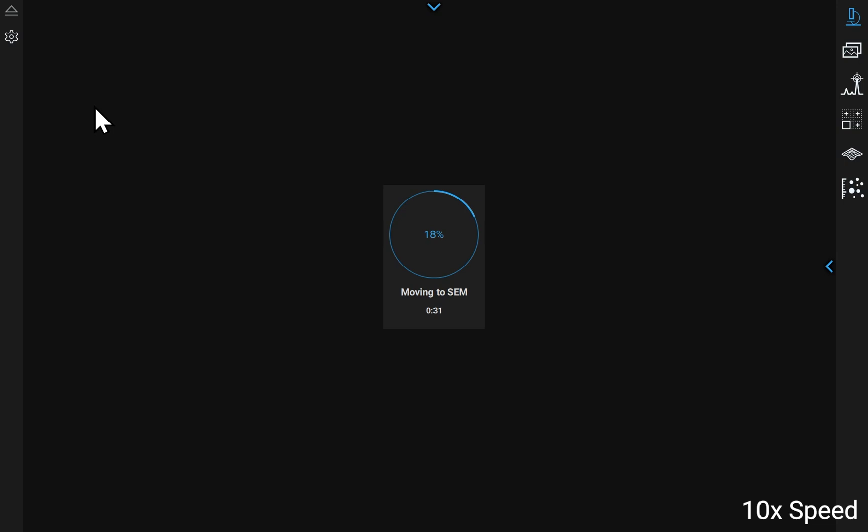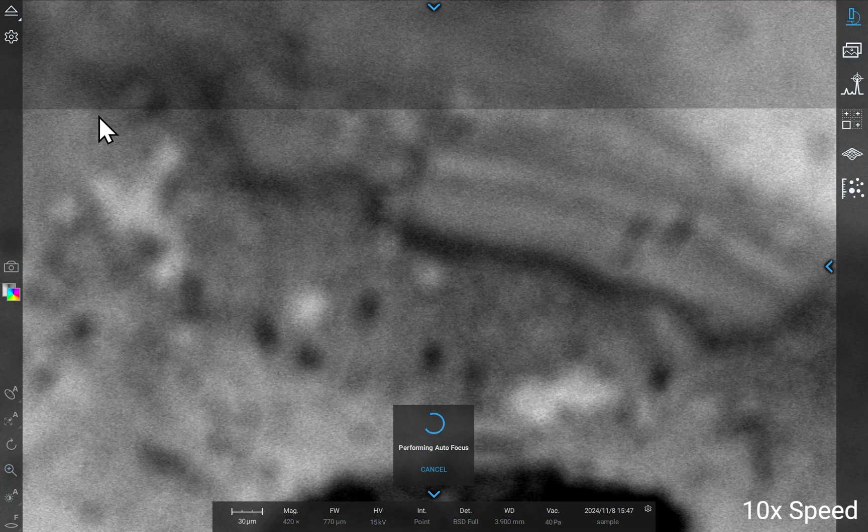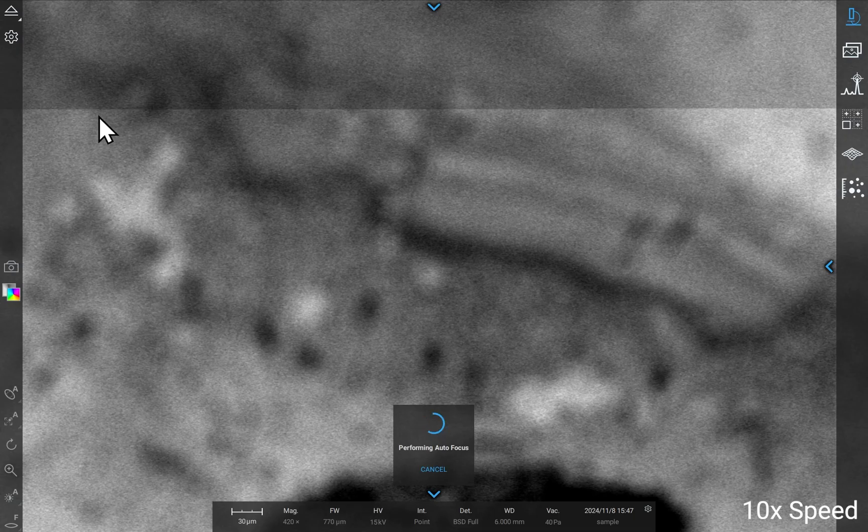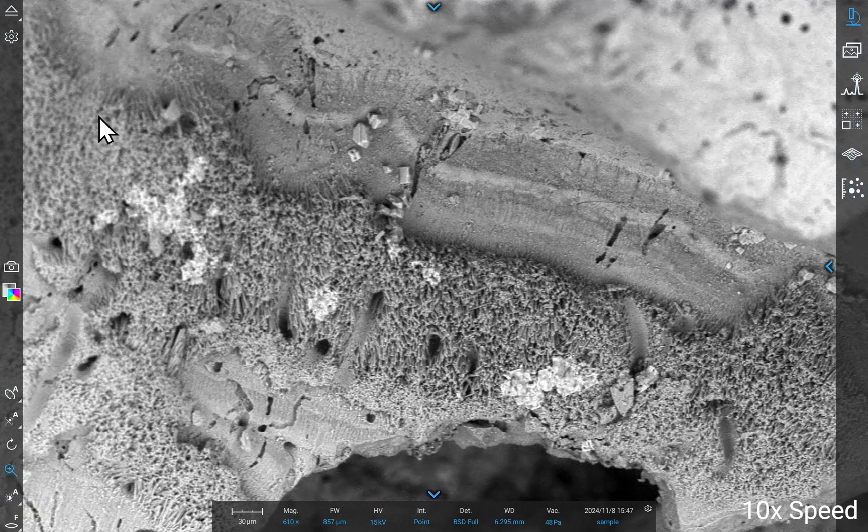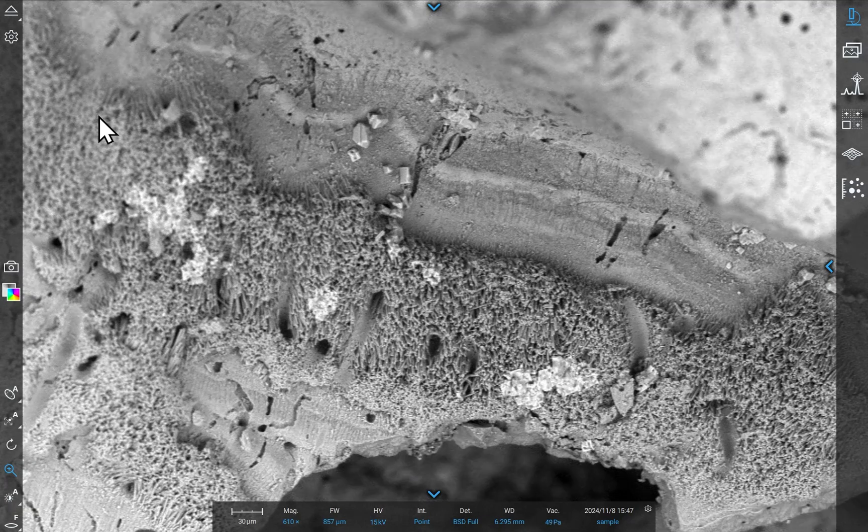In less than a minute, the SEM Electron Beam will be on and ready to go. The system will automatically start with autofocus and autocontrast brightness.